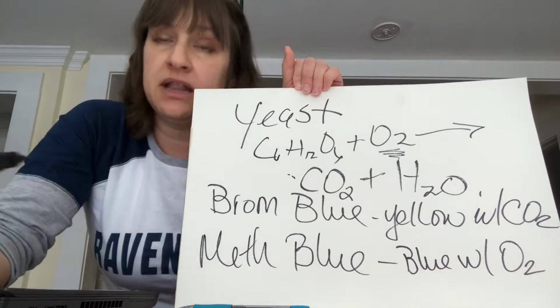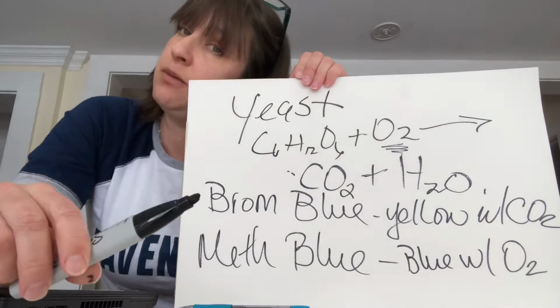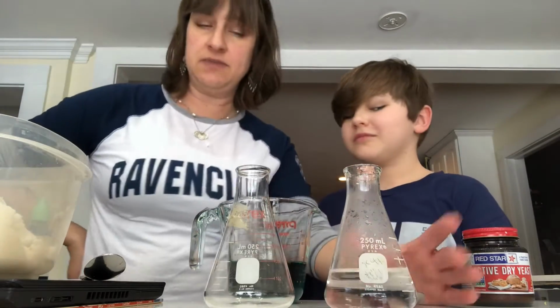All right, now I'm going to get my little lab assistant and our supplies, and we're going to set up the lab so you can see what it looks like before and after. Okay, here we are. Got my trusty lab assistant here. And we're setting up the experiment.